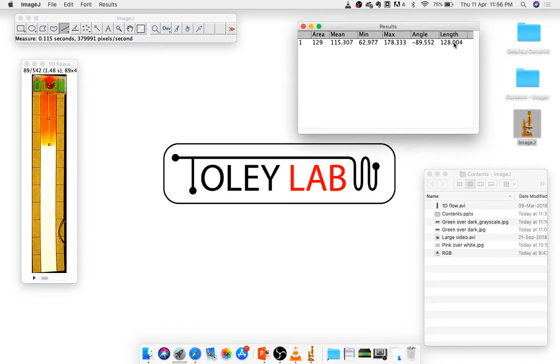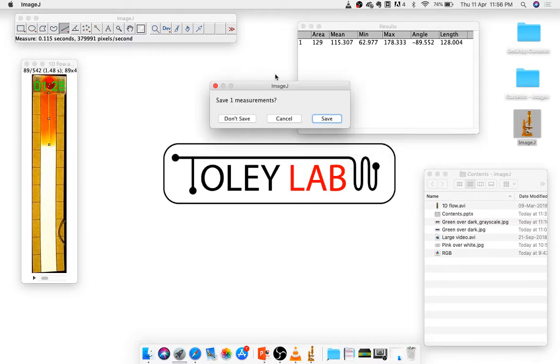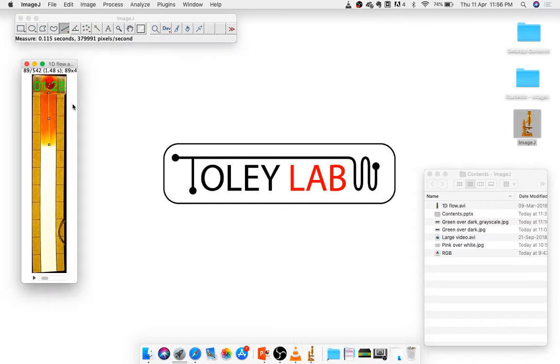However, this is in pixels, but we need distance in real distance units, centimeters or meters. So if you know the conversion, of course you can keep measuring things in pixels and then do the conversion later, but there's a very convenient way of doing this. You can set scale in ImageJ. Let's say I don't have any gradations, but I know that my width is 1 centimeter, right? That is how the strip was designed. So I can draw a horizontal line here whose width I know is 1 centimeter. So I have that selection here. Then I go to Analyze, Set Scale.